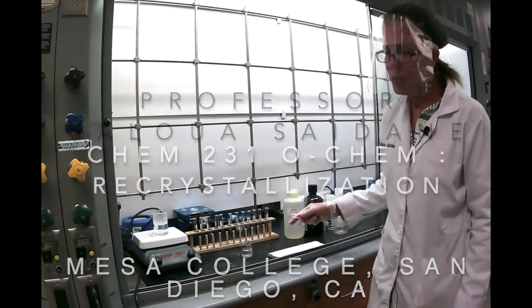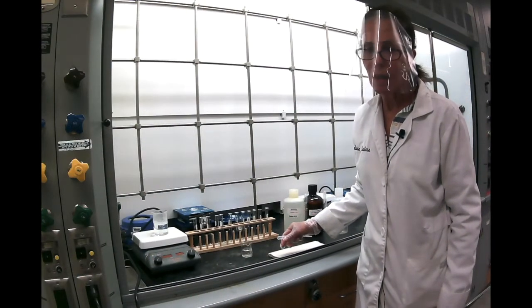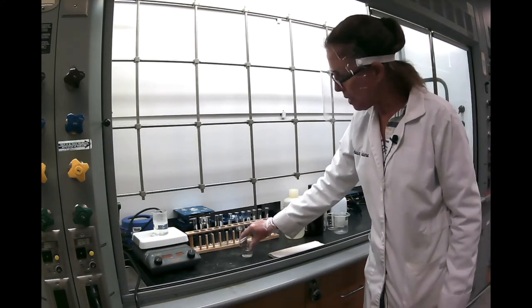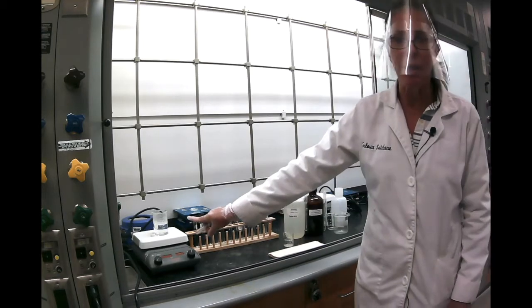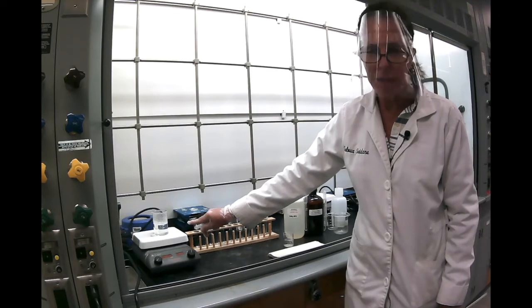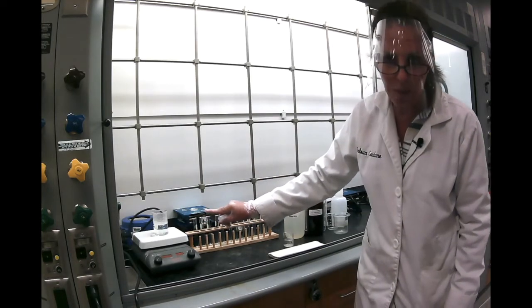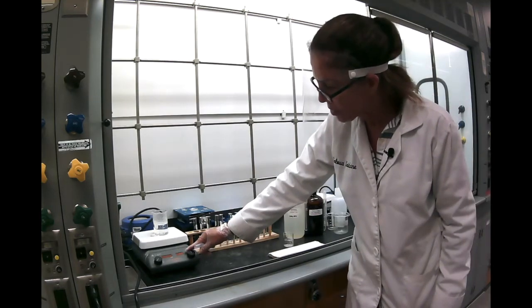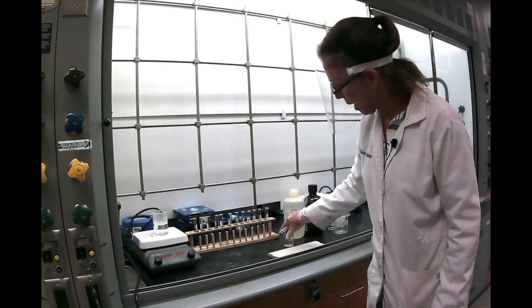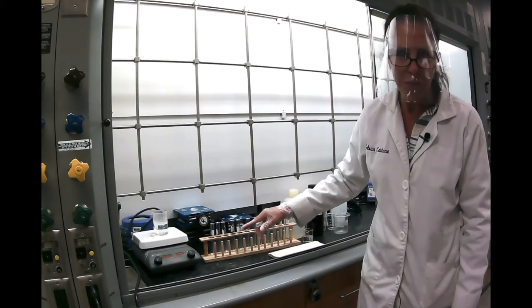So this is the first step of the recrystallization lab, which is choosing the right solvent for the substance. We started with some tap water heated, and it shouldn't be boiling really hard. It should be just like that. So keep controlling the temperature, don't overheat it. And while it was heating, I went ahead and measured 0.1 gram of each substance.